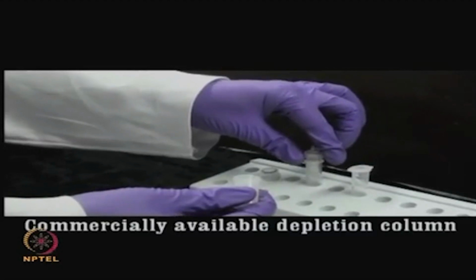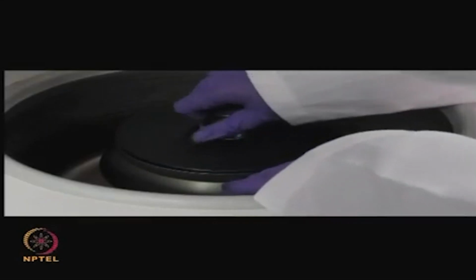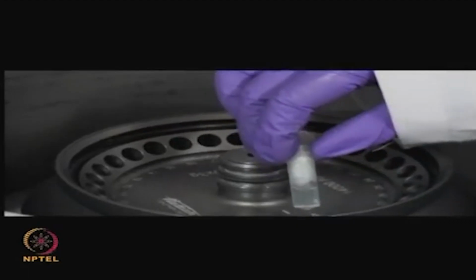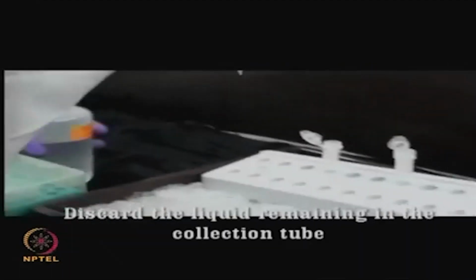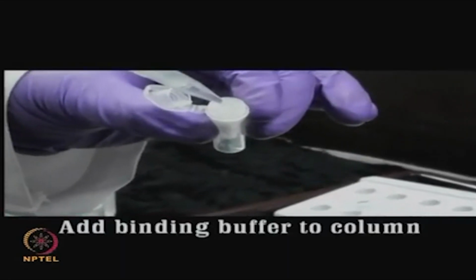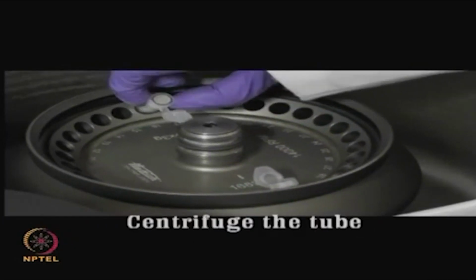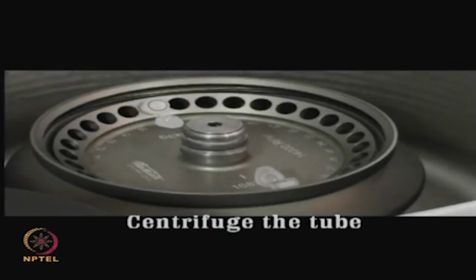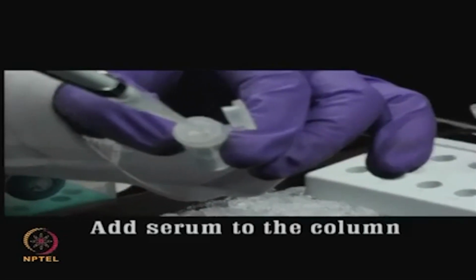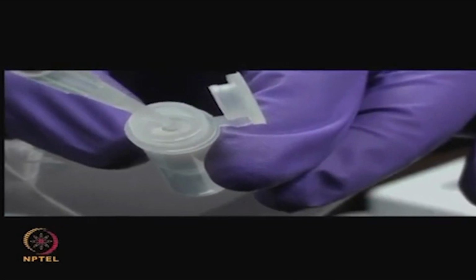Open the cap of the column, place it in a tube, and centrifuge it after addition of phosphate buffer. Discard the liquid that remains in the collection tube. Then, add the binding buffer provided with the kit to the column and centrifuge the tube. Next, add the serum sample to the column and incubate on ice for 5 minutes.